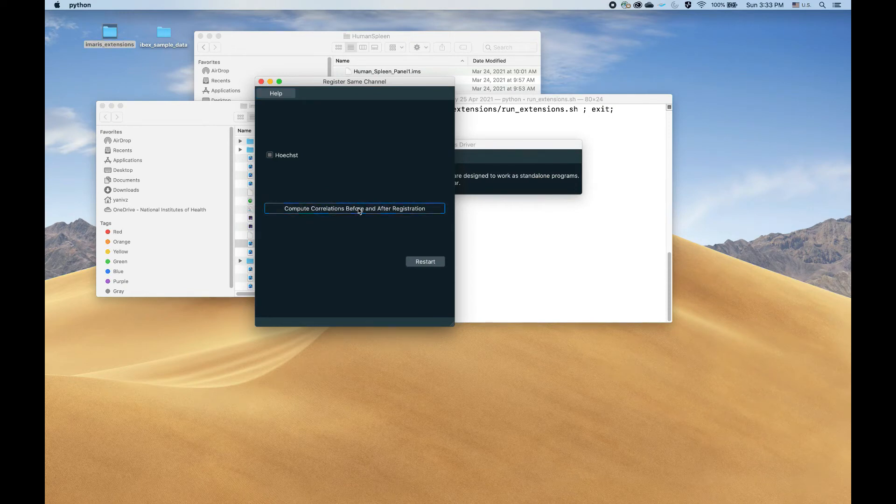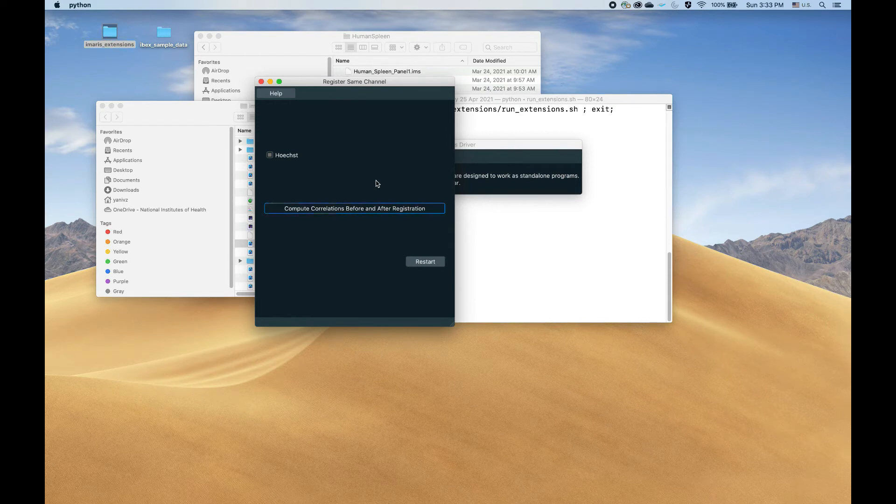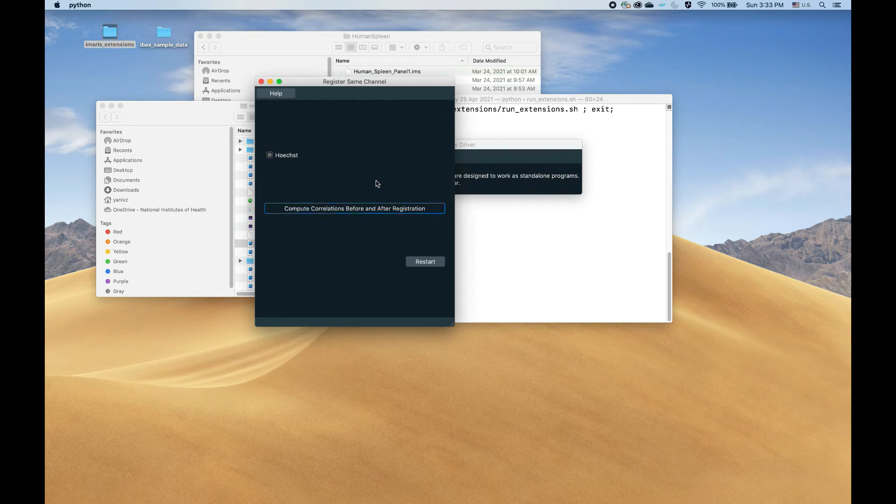Let's press the computation. Again, this will take a bit of time because of the file sizes involved in the computations. We'll see in a second what the results are.